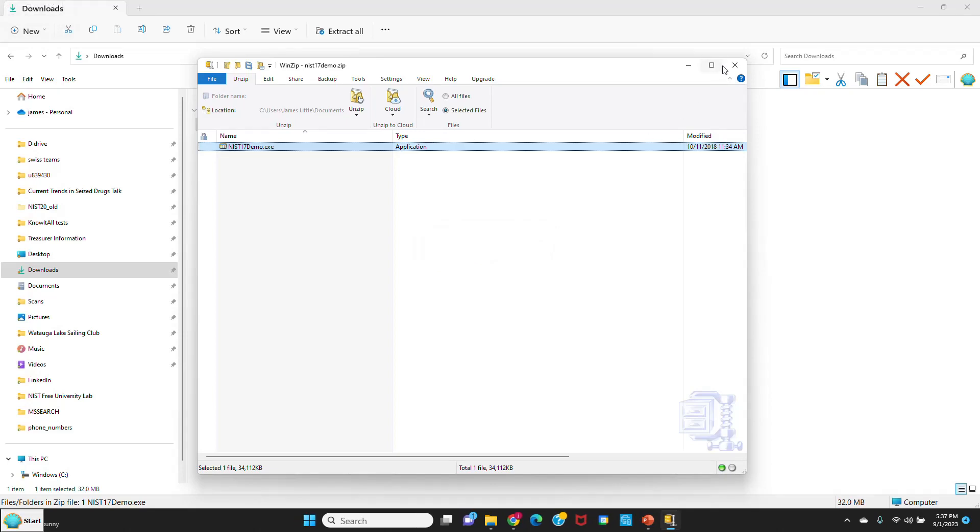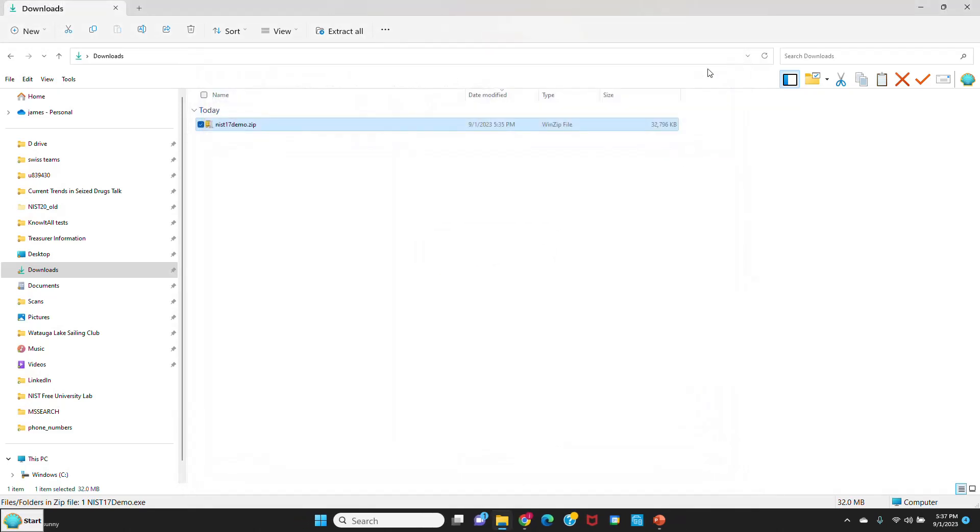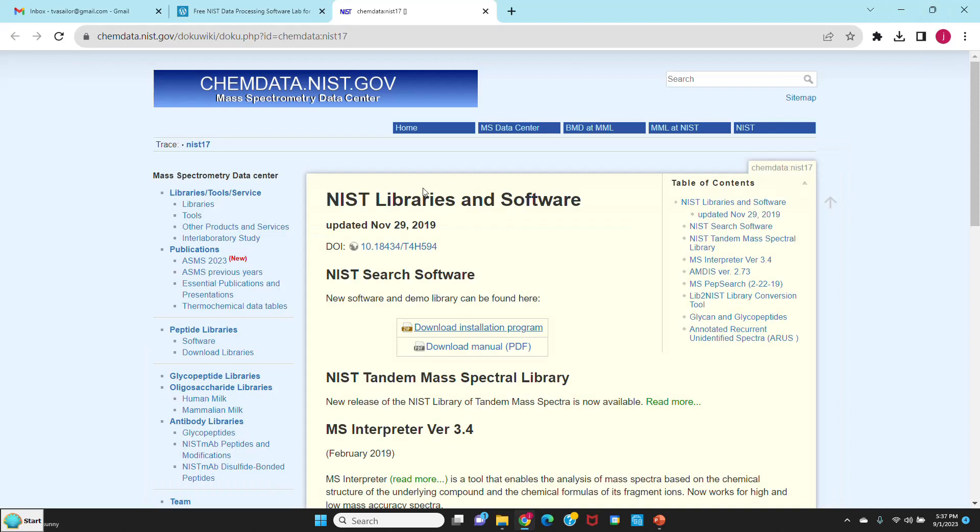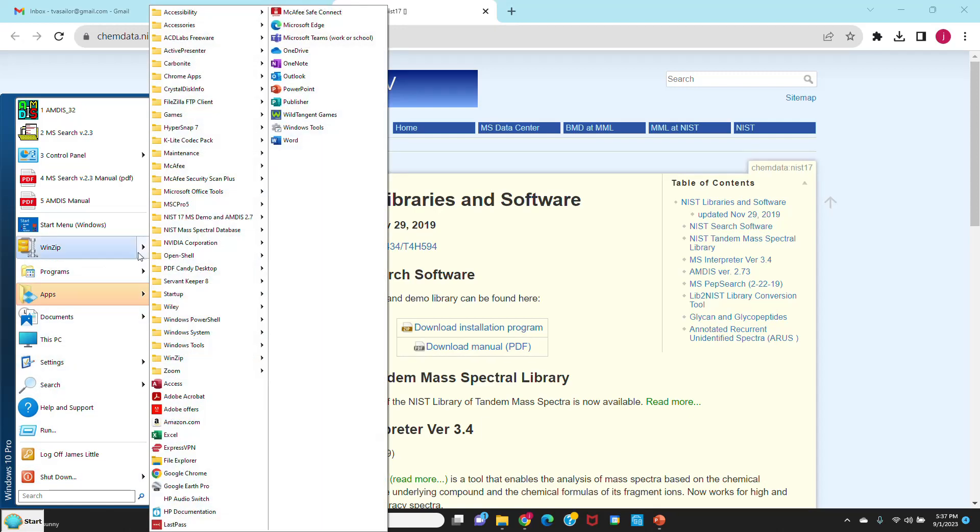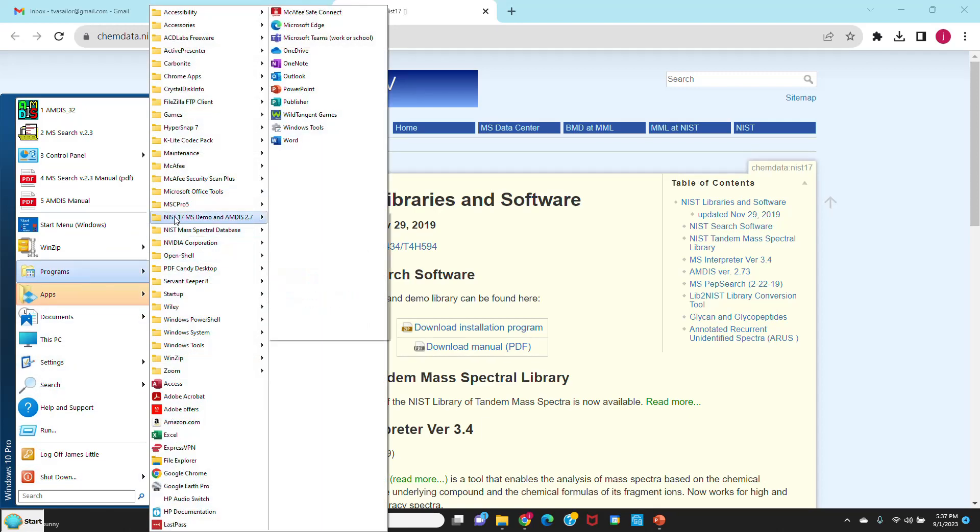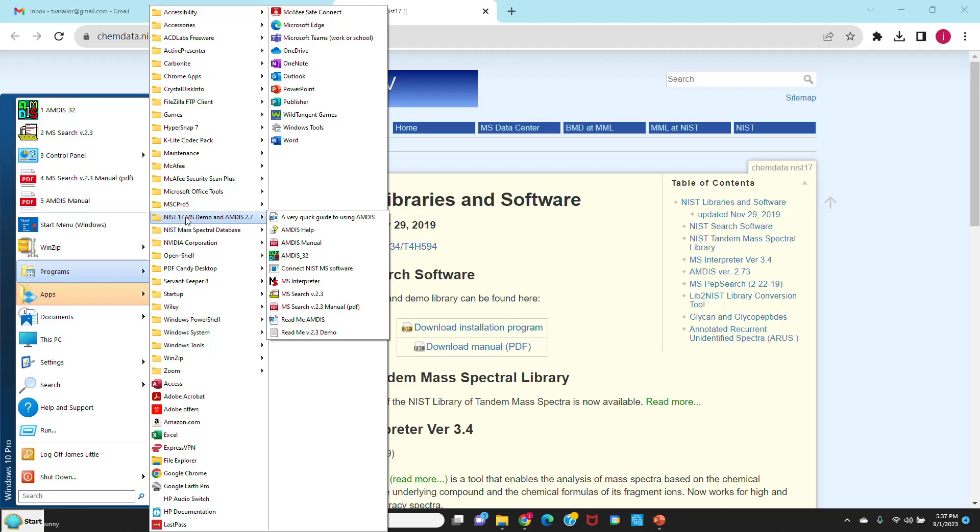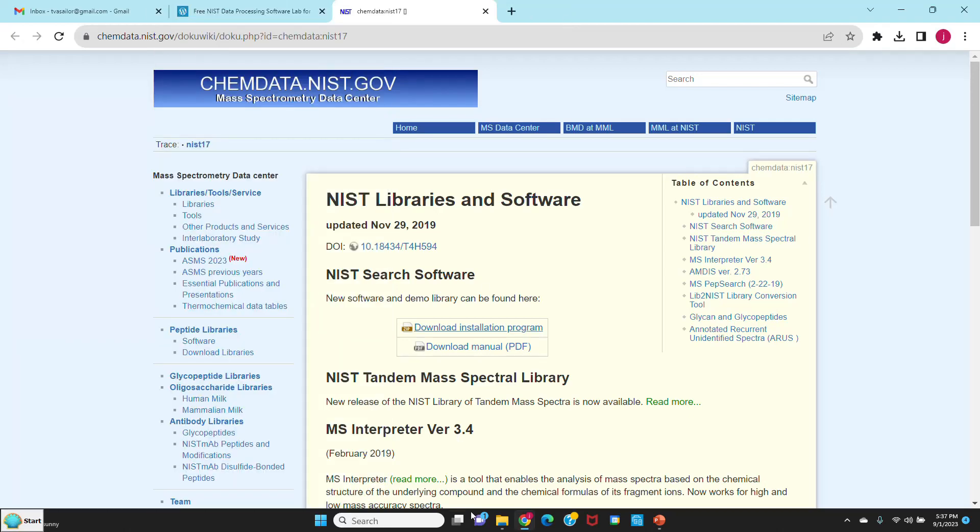I'll close my download file and minimize that. I'll go over to my start menu at the bottom of my screen in Windows and go up to programs. You'll see the NIST 17, and there's all the programs that you need to run plus all the manuals. NIST 17 MS demo and AMDIS 2.7. So it looks like it installed properly. So let's go do the ACD installation now.